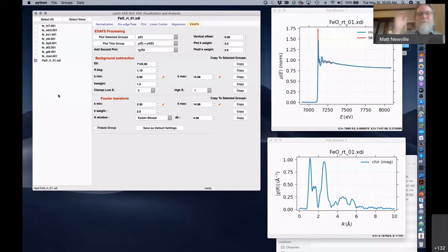And there is one more: what is the limit with data matrix that can be managed by Larch? Because for Athena, it was about 40, I believe, if I'm not wrong. But is there any limit? Yeah, I don't know what the limit is. Basically, thousands of spectra can be handled. We often have projects that are 50 to 100 spectra without any problem at all.